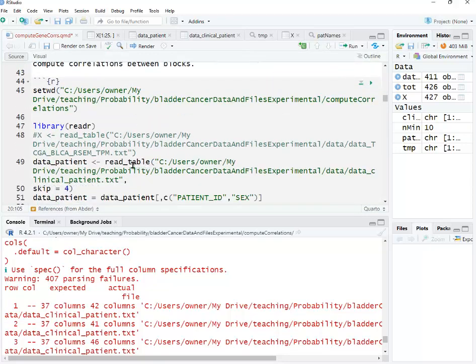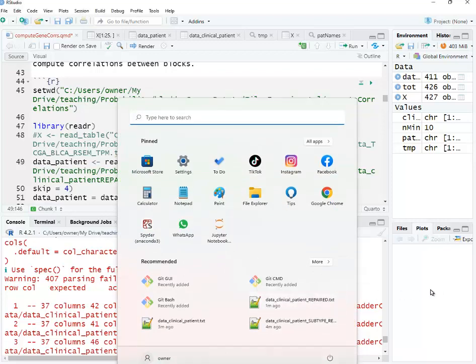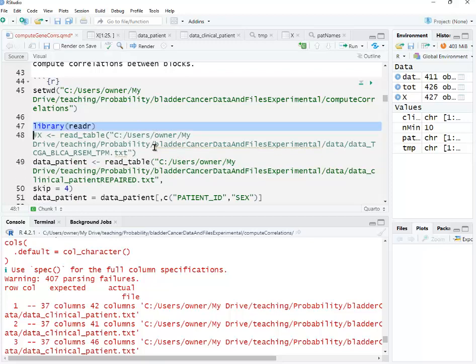So this was here instead of this one I had repaired. And now I'm forgetting what I actually called it. Did I put an underscore first or not? Oh, I don't know. Actually, the easiest way to do that is to go here. Yeah, it's with underscore. Okay. And then, whoops, sorry. Yeah, you need underscore. All right, now what? I'm screwing up everything.